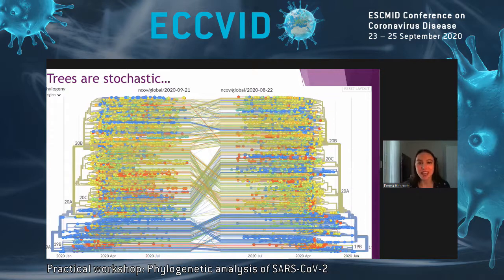But similarly, this can mean that, for the same reasons, your inference as far as where a particular sample, like a very detailed sample, came from might change depending on the sequences that it has in its background in any particular run. Overall, we know the global picture of how SARS-CoV spread quite reliably, but when looking at one particular sequence, this is a lot harder to tangle out. And similarly, the lineage that might be inferred, for example, if you're running pangolin, which we'll cover shortly, might change depending on the background that your sequence is with over time, but its position at large in the tree is unlikely to change significantly.